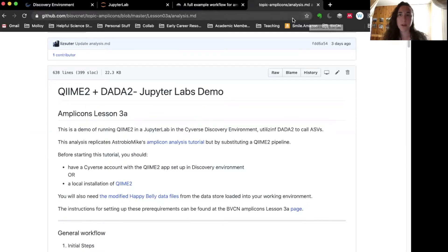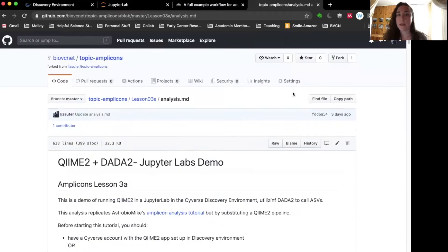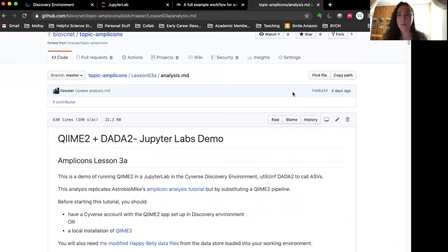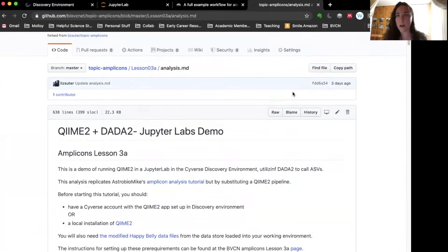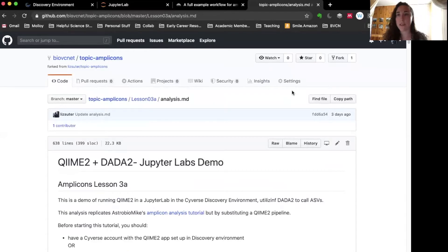Hello, my name is Liz Suter. I'm an assistant professor of environmental sciences, and today I'm recording this video to show you a run-through of an example QIIME 2 pipeline for analyzing 16S amplicons. This particular tutorial is posted on the BVCN GitHub and it's lesson 3a of the amplicons channel, so all of the details of the tutorial are there. I will also make the notebook that I generate today with full annotations available through the BVCN network as well.